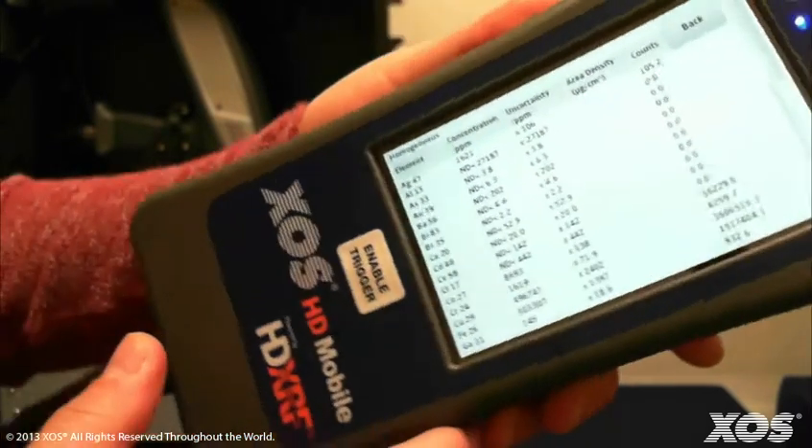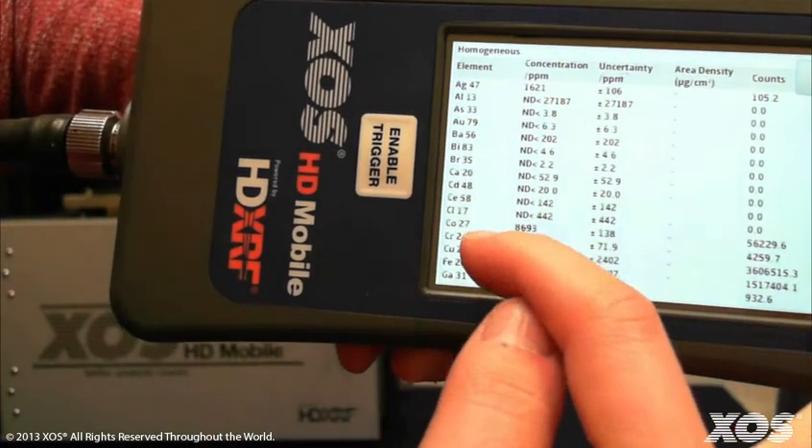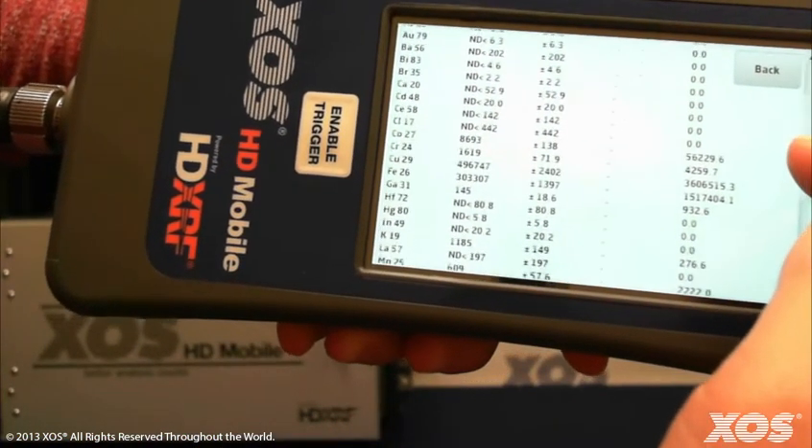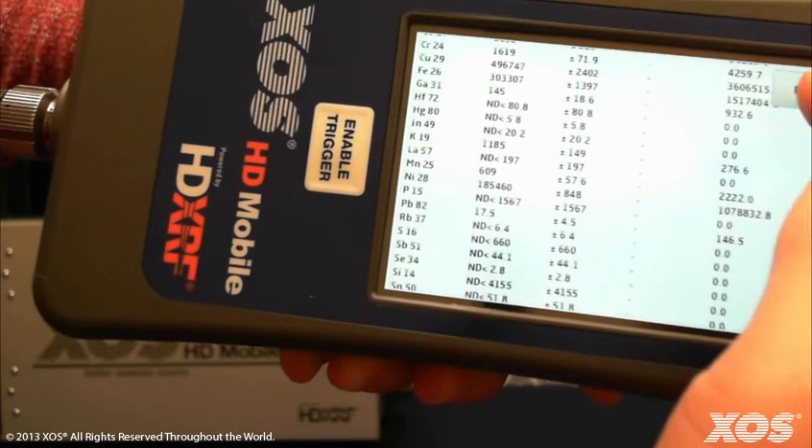In addition to the 10 elements listed on the main screen, the HD Mobile detects and reports results for over 30 elements. All results are available and listed in alphabetical order by elemental symbol.